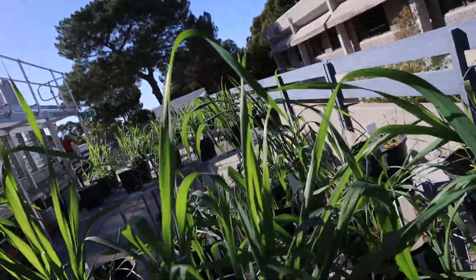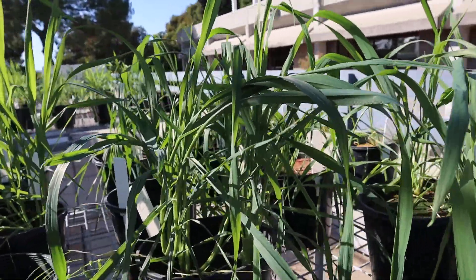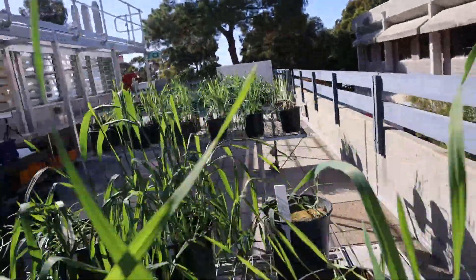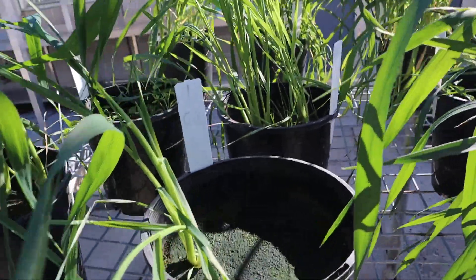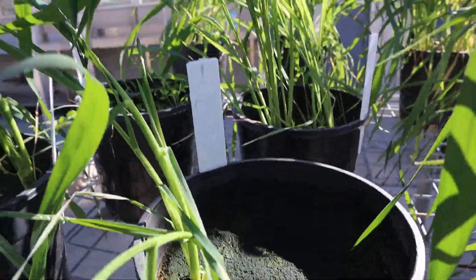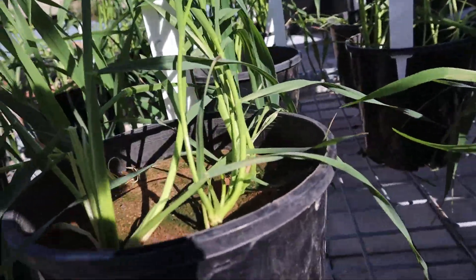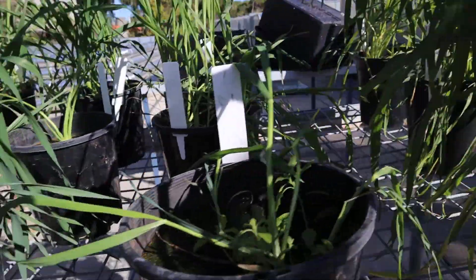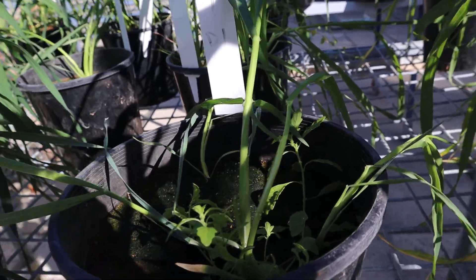Next is soil C. These ones aren't looking too bad. The plants are looking reasonable in this pot.